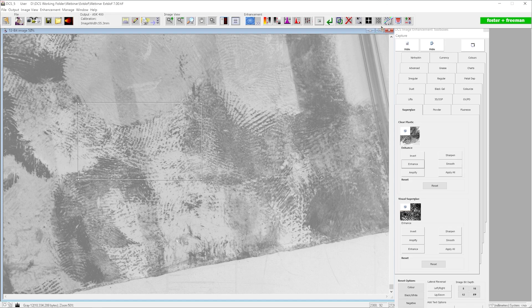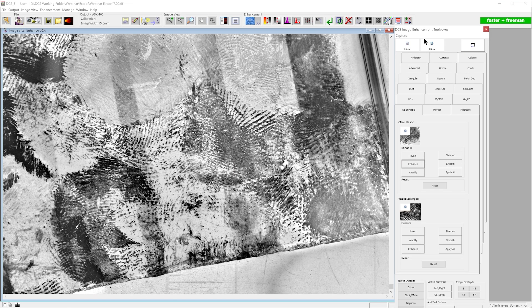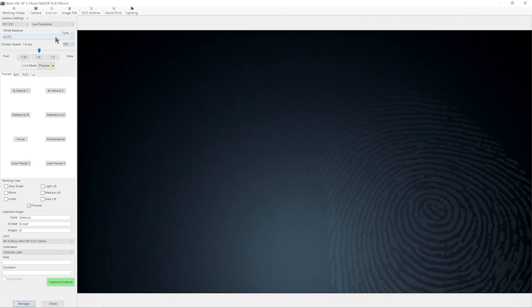Sometimes the 'enhance' effect can be a bit much if we already have quite good contrast in the mark. It's important to understand that with DCS, applying an enhancement to a small area of interest can look very different to applying it across the whole image. So if you don't like the effect across the whole image, it's worth applying it to an area of interest, and vice versa. Then we can output the image to our network location, ready for somebody else to view.